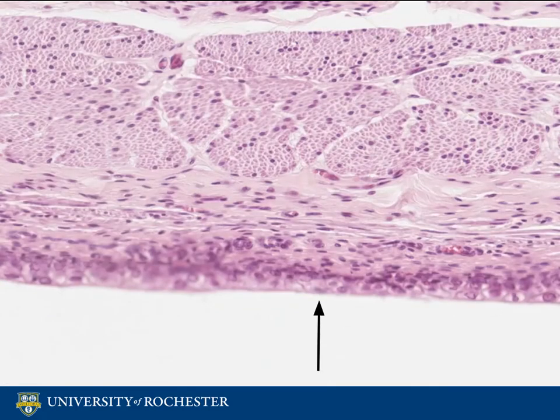If you scroll down the same slide, you will see a cut of another section of the bladder. Here you can see that in some places the transitional epithelium appears to be much thinner. If the bladder becomes distended, then the urothelium can be stretched out and ends up consisting of stratified squamous cells.